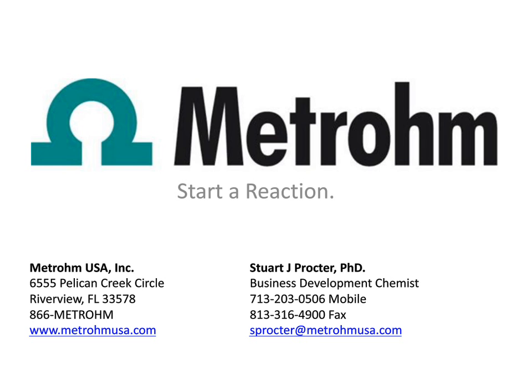Great, thank you. Stuart, anything to add? Not really on that one. I have to say, most of what we deal with is actually samples that arrive in the laboratory and how we take that from point A to point B. Of course, there are things we recommend to be done to samples to preserve them before we analyze them. And quite often that procedure can actually cause more of a headache because sometimes we have to get rid of that matrix after we put it in there to prevent things from happening.